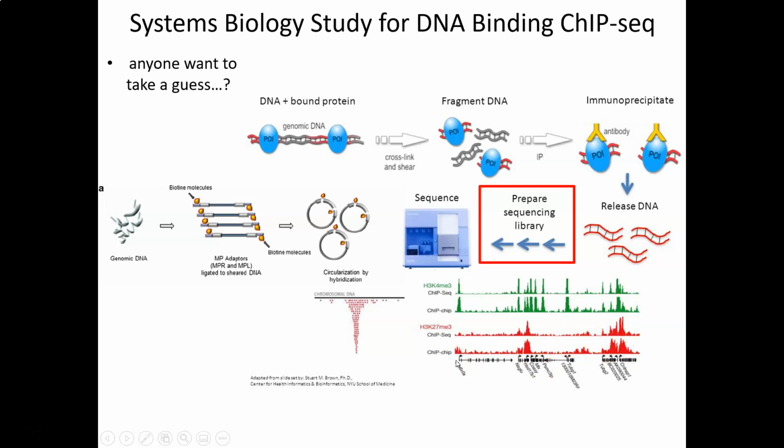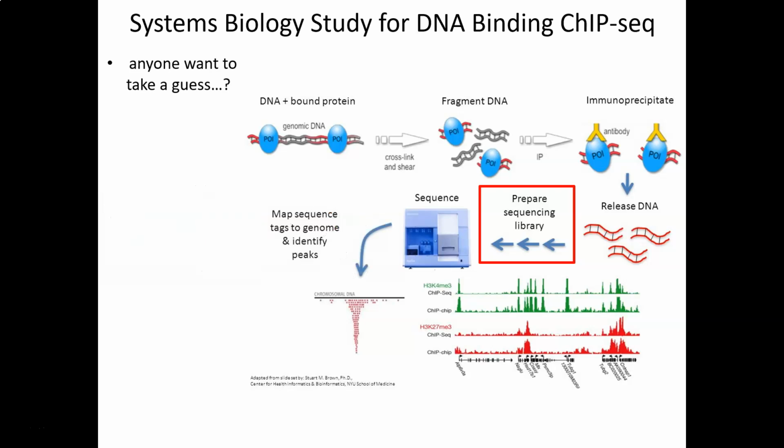So we get, again, a genome-wide survey of where our protein of interest is bound across the entire genome at the time at which we cross-link the cells. To try to say it more simply, we are detecting every single place in the genome that our protein was bound to when we hit those cells with formaldehyde. That includes regions we suspected our protein was bound to, and regions we had no idea our protein was bound to at all. This is systems biology. It's surveying the entire genome. It's giving us a snapshot of protein of interest binding everywhere at any one time. Amazing, amazing technology.